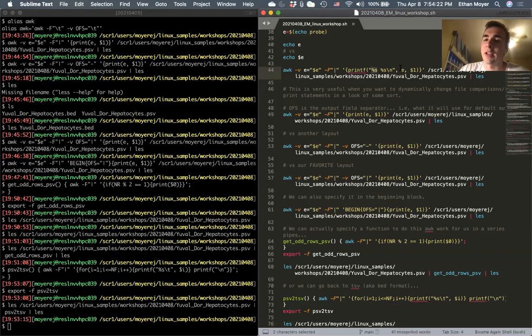So right here, this corresponds to the first following argument, so it corresponds to an E. You can think of whenever you see %s as placeholders for following arguments, like E is a string, and this happens to be a string, so it's put right there.